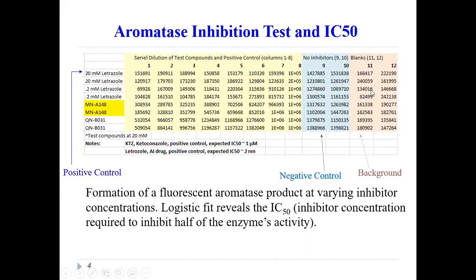What this is meant to do is the instrument subtracts an average of these two values from the rest of the data, because even though there is nothing but acetonitrile and whatever dust is in the air in those cells, it's still getting a tiny bit of fluorescent reading. Maybe that's reflection off of another cell, or some random light artifacts that are around, right?